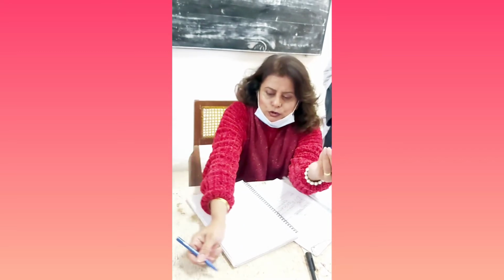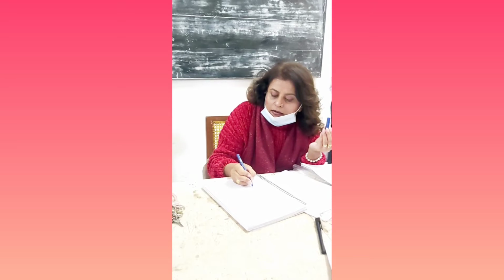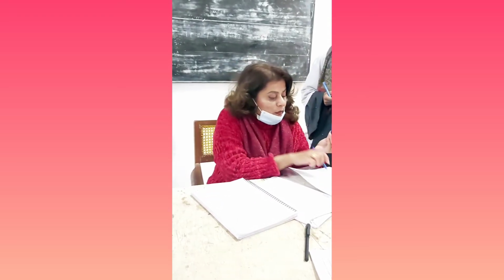Now we are going to introduce a few granules on this sodium, right? This is what they have written here. Add the organic compound in such a way that it covers the sodium piece. Only add that much amount that it should cover the sodium metal. That is this much amount. Only this much amount should be added, that it should cover the sodium metal. It should be of this much size. Now what are you going to do?